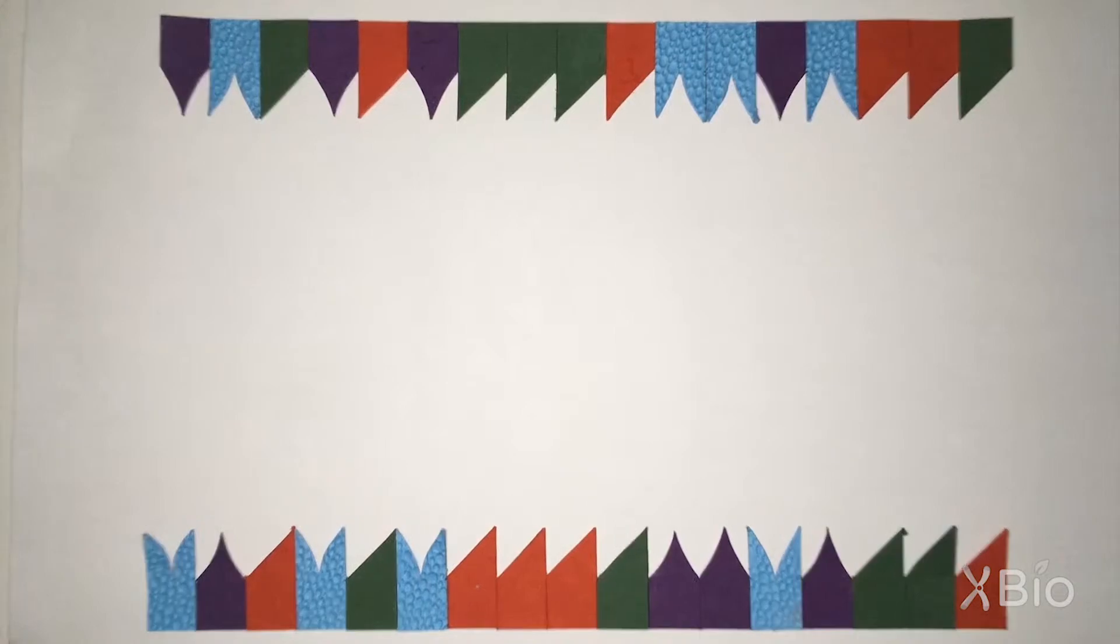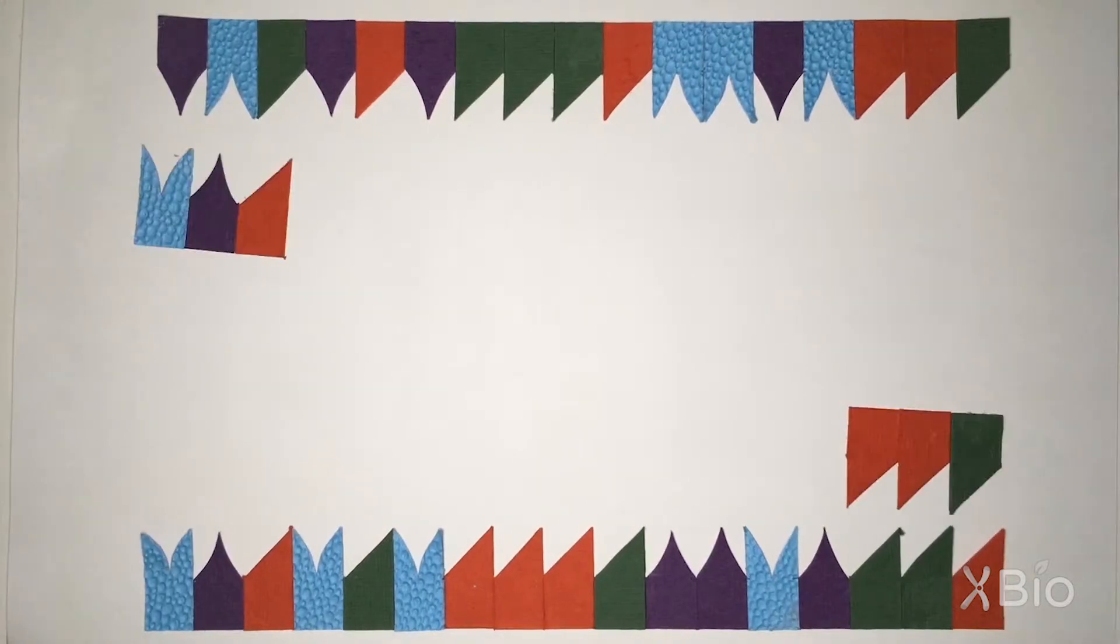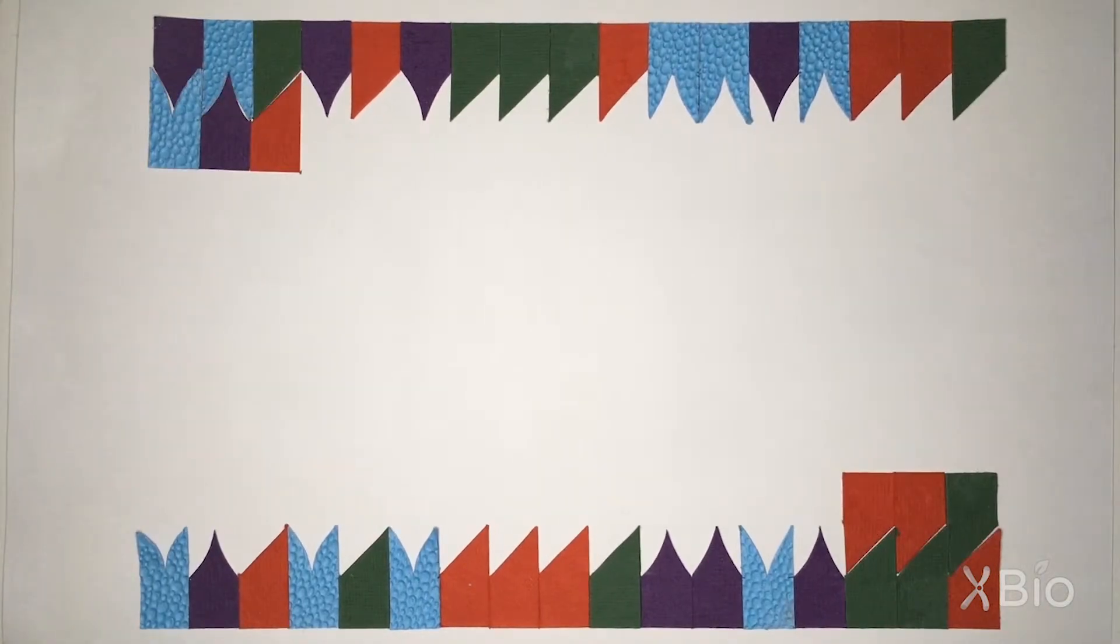Depending on what piece of DNA we want to copy, we design the sequence of A's, T's, C's, and G's in the primer to specifically match the beginning of our sequence.